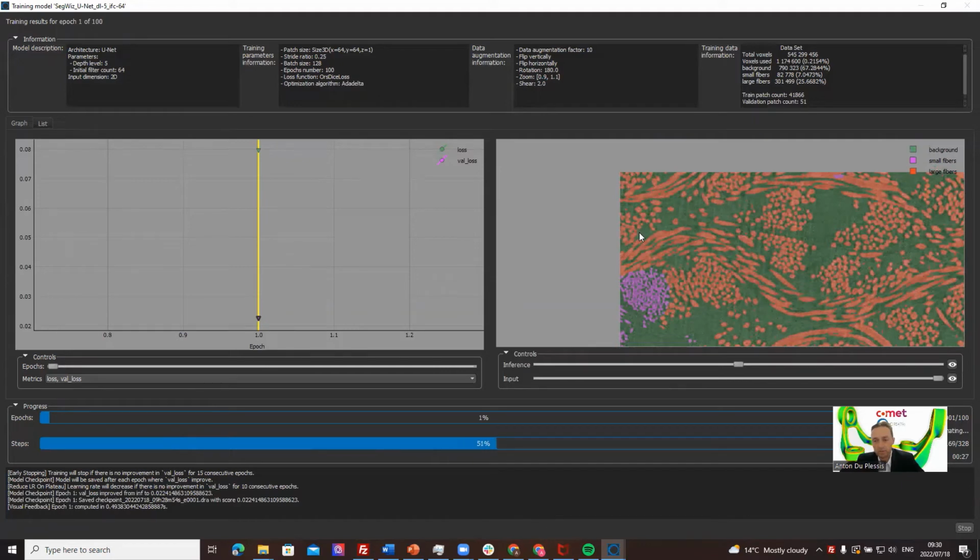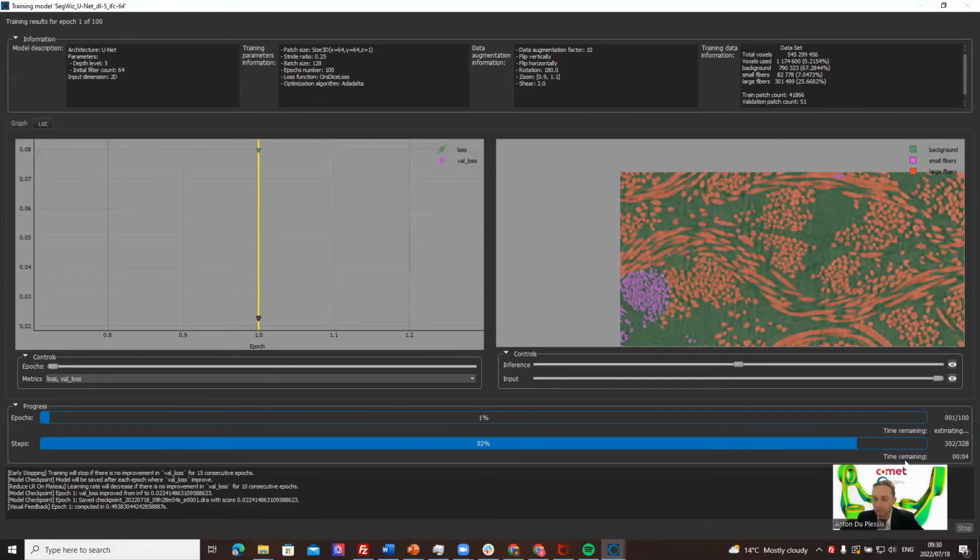My role here is just to show you where the functions are and how to use it. So that's why I'm not discussing in detail all the parameters. And also that's why I've only noticed here for the first time that I can zoom in on the preview, but that's quite nice. You will be similar to me, often surprised at the functionalities and the flexibility in Dragonfly.